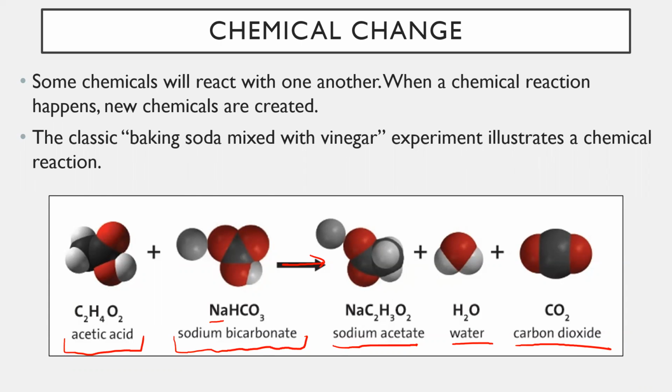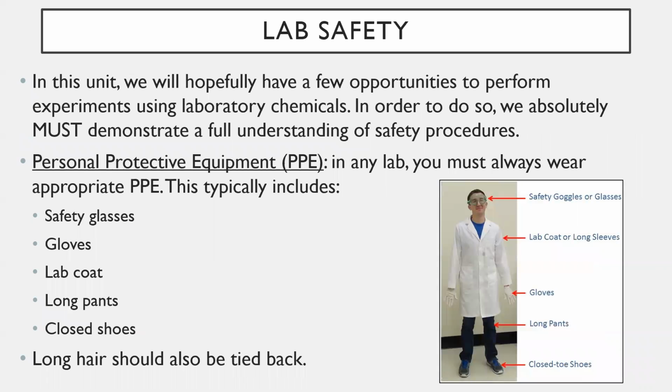The main focus for today is going to be on lab safety. Ooh, I just skipped ahead too far. Here we go. There it is, lab safety. So in this unit, we will hopefully have a few opportunities to perform experiments using laboratory chemicals. In order to do so, we absolutely must demonstrate a full understanding of safety procedures. It is super, super important, right? If we're dealing with a science lab, we have to make sure we are safe at all times.